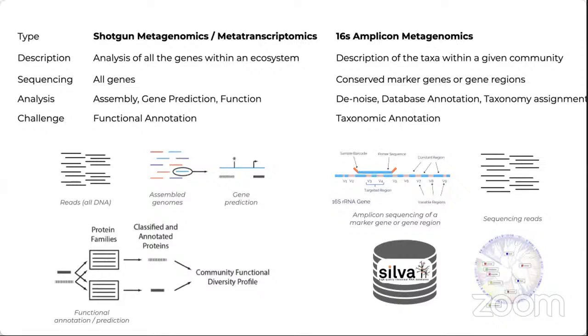We can also do prediction of the genes across to be a key factor or key player in maintaining this metabolome and their processing levels. So while shotgun metagenomics and transcriptomics will address the functional level of the microbial population, in addition to sometimes giving us an estimate of these microbial populations, more reliable methods in estimating the abundance level at the taxonomic level can be performed using 16S amplicon metagenomics, right?